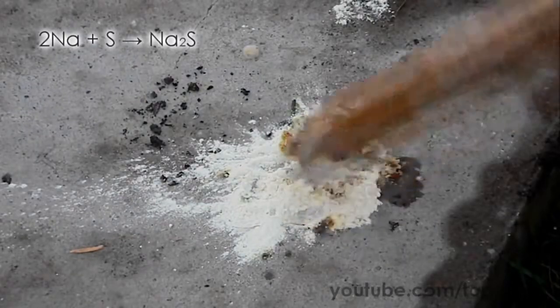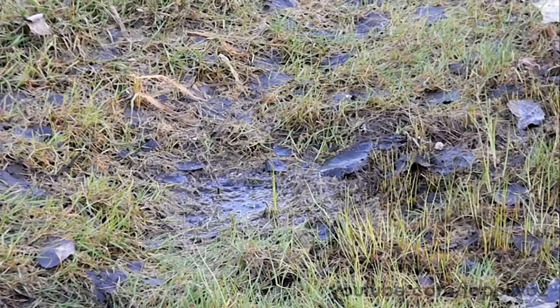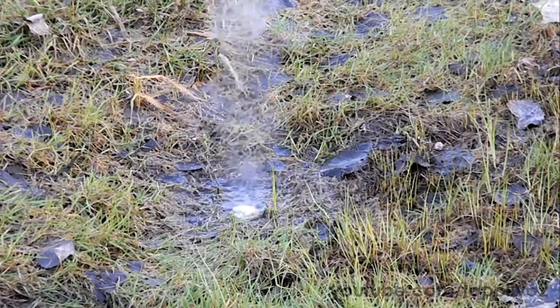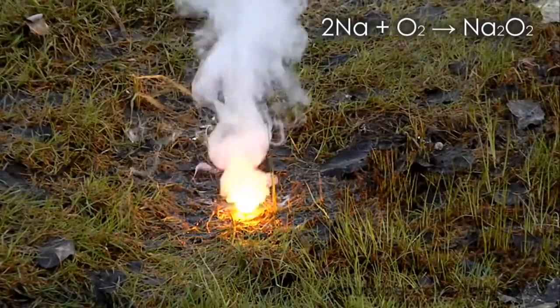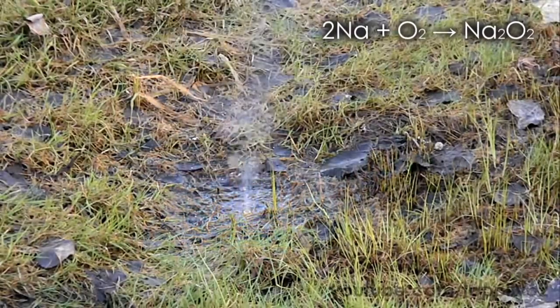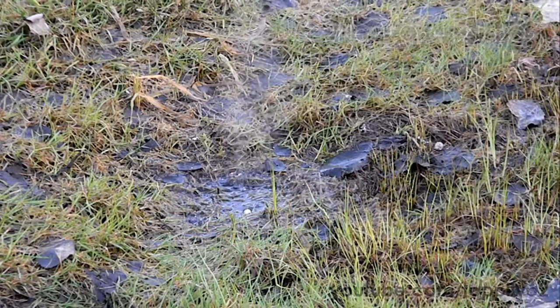I quite like the behavior of sodium on the wet grass. If you put sodium on the wet grass, it ignites and starts to burn. The product of this reaction is sodium peroxide.